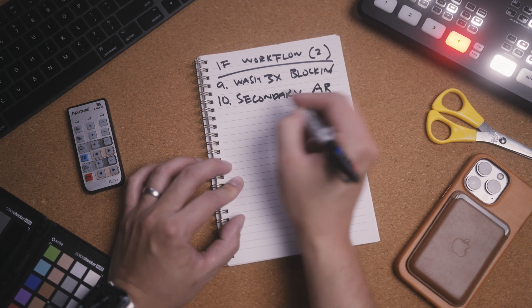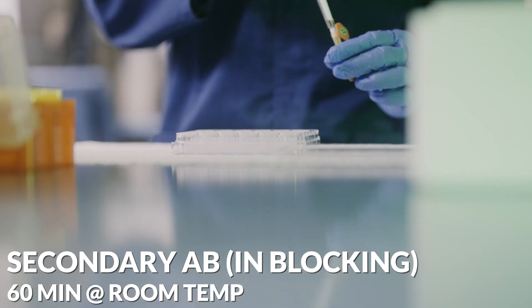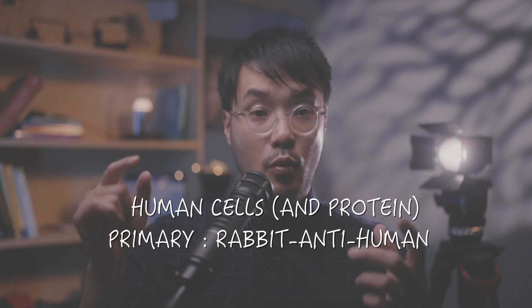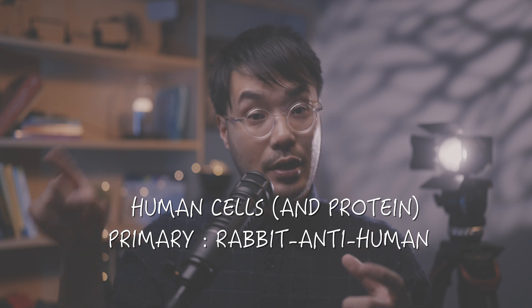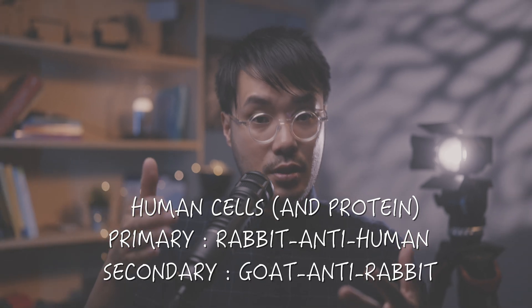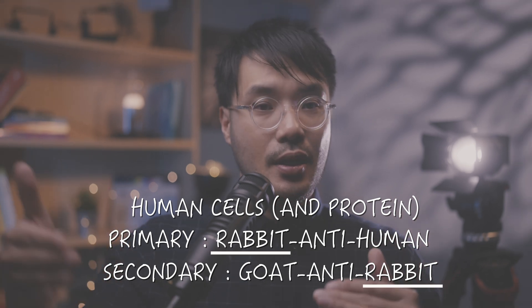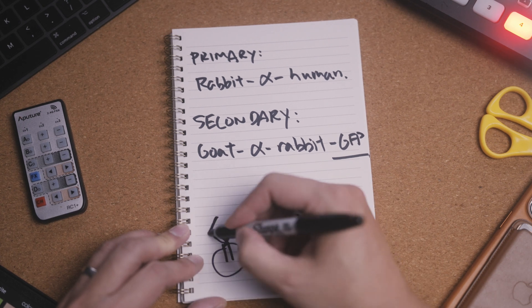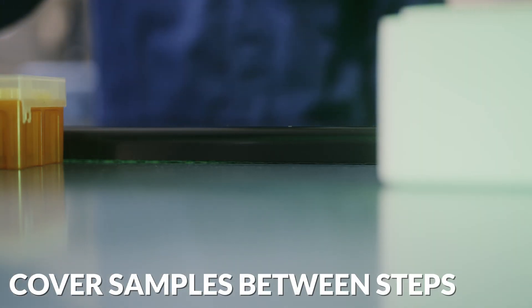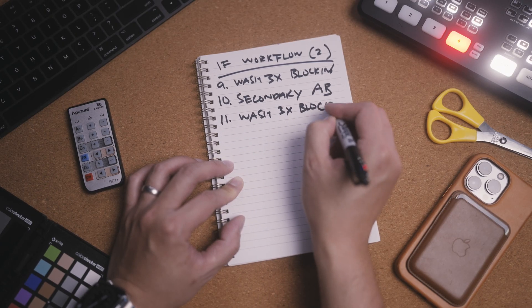Now add the secondary antibody. The secondary antibody is designed to bind the primary antibody, not the original target protein. We're working with human cells in this example and the primary antibody was rabbit anti-human. The secondary antibody needs to be raised in another organism — not human or rabbit in this example — against the primary antibody; in this case, goat anti-rabbit. Given that the only rabbit protein on the human cells is the primary antibody we just added, this ensures specific binding between the primary and secondary antibodies. The secondary antibody is conjugated to a fluorescent label, so we need to perform all the remaining steps in a light-sensitive manner. We leave the secondary antibody on for 60 minutes at room temperature before washing off with blocking solution three times.